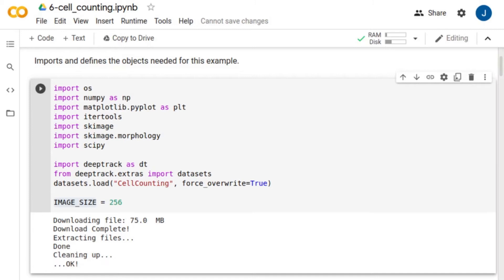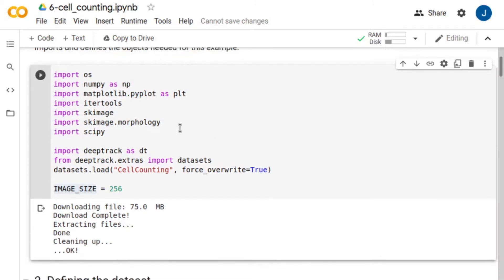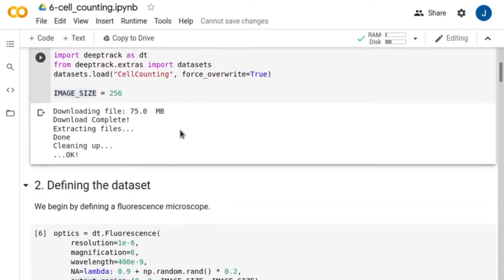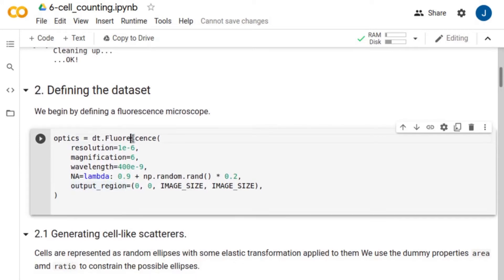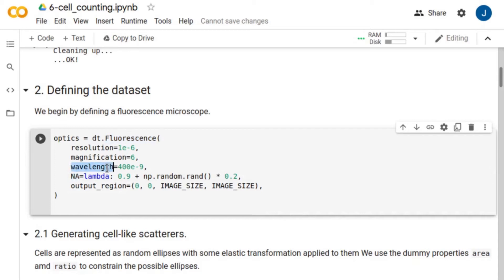In this example, the training dataset consists of synthetic data generated by imaging cell-like objects through a simulated fluorescence microscope, with numerical aperture between 0.9 and 1.1, and illuminating laser wavelength of 400 nanometers. We also define the resolution and magnification of the microscope.